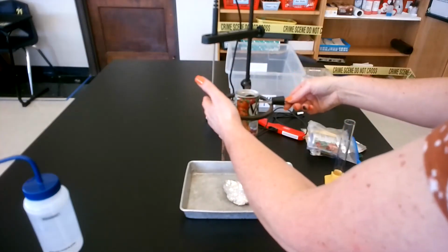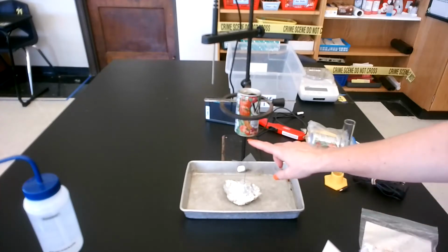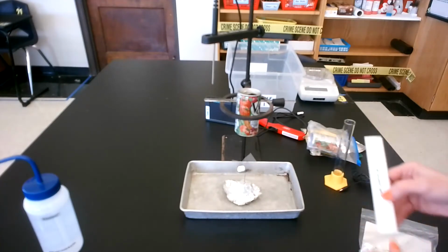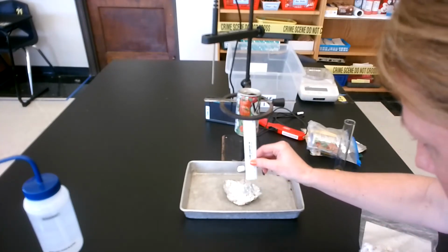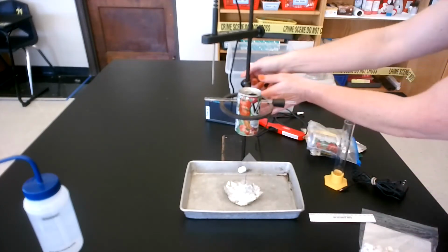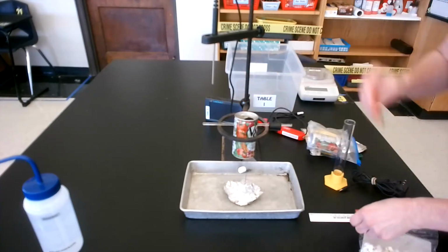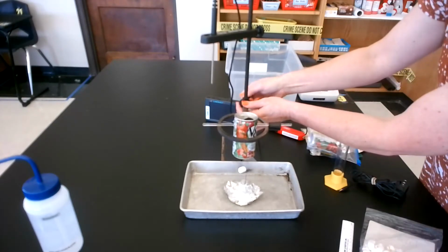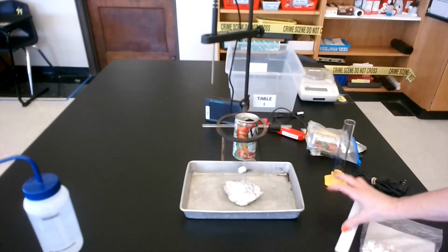So I'm going to put this in my ring, and I will need to adjust this. I need to have the bottom of the can 1 inch from the top of the food. This is where 2 people comes in handy. One person can hold the ruler at eye level, and you don't have to touch it, because it is kind of hard to do. My partner is going to come over and lower the ring, and she's going to tell me when to stop, when she sees that the top of the food to the bottom of the can is 1 inch. You may have to adjust this because when you tighten and loosen it, it does move a little bit. So there, we're going to say that's 1 inch.